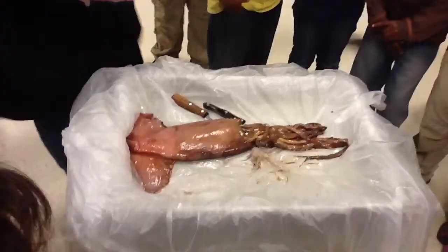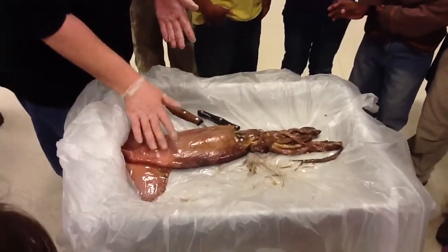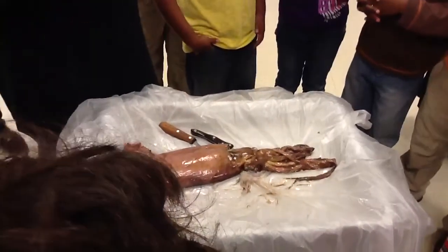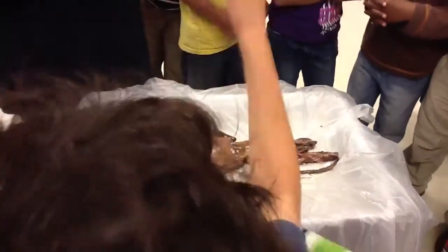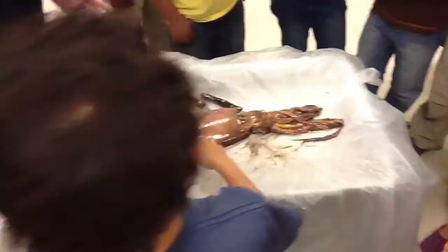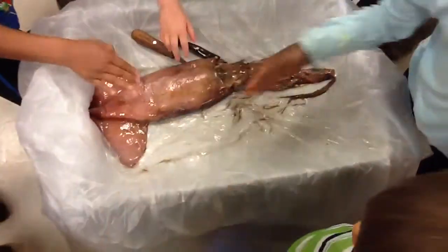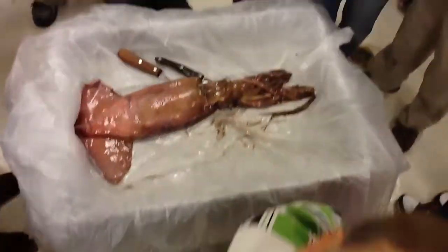If we want to touch it, we can touch it now, and then we'd have to go wash our hands right afterwards. If you want to touch it, I suggest the best place to touch it would be the mantle. I don't think you guys need gloves — it says you don't need gloves. We just need to wash our hands afterwards. It's been frozen. If you're at the red table and you want to feel it, just a touch — a gentle touch. You don't want to mess anything up inside. And when you're done, go to the sink and wash your hands.